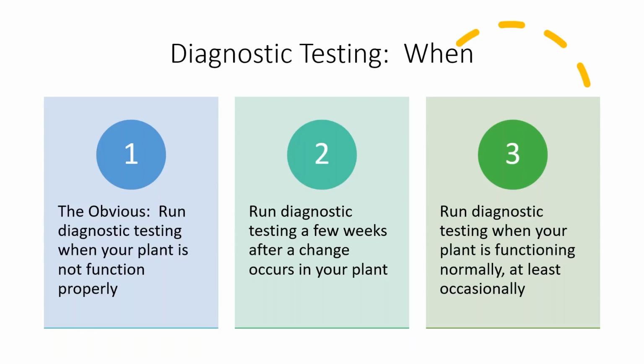So when do you run a diagnostic test? You run diagnostic testing when your plant is not functioning properly, but you also want to run it when it is functioning properly. This all has to be within reason of the expenses your plant is able to deal with. So ultimately, the more frequently you run diagnostic testing, the better. But there are limitations in what you're able to run.